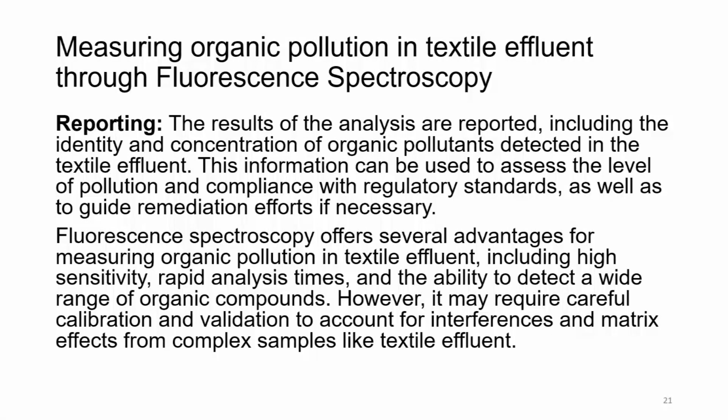Reporting. The results of analysis are reported including identity and concentration of the organic pollutant detected in textile effluent. This information can be used to assess the level of pollution and compliance with regulatory standards as well as to guide remediation efforts if necessary.